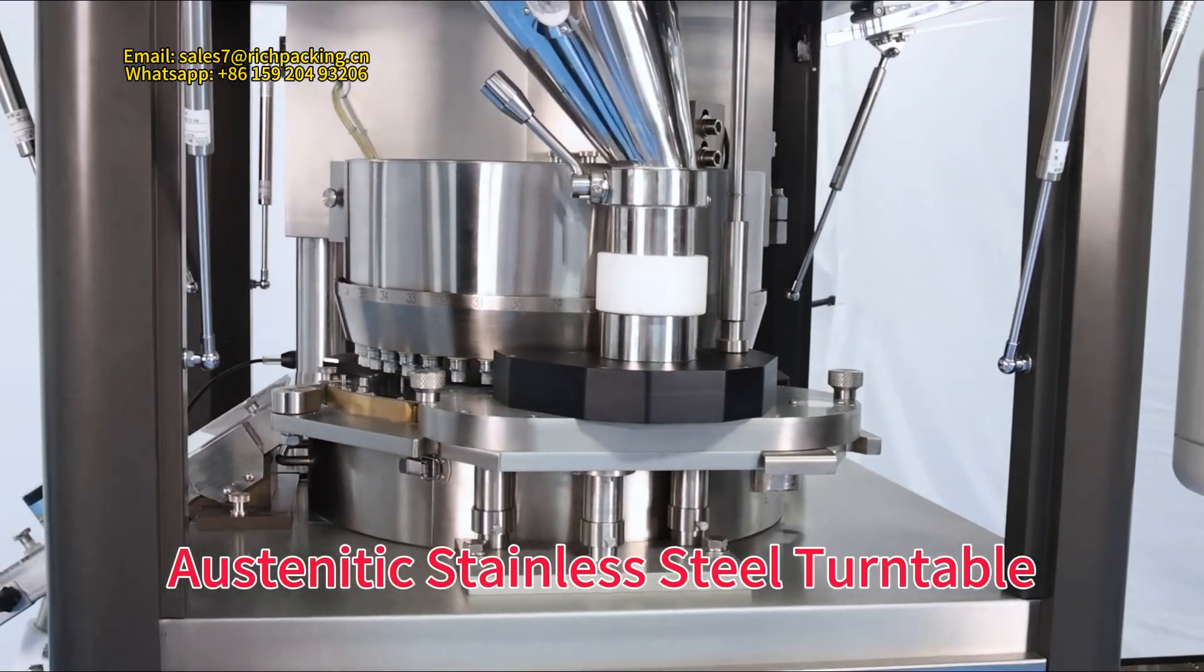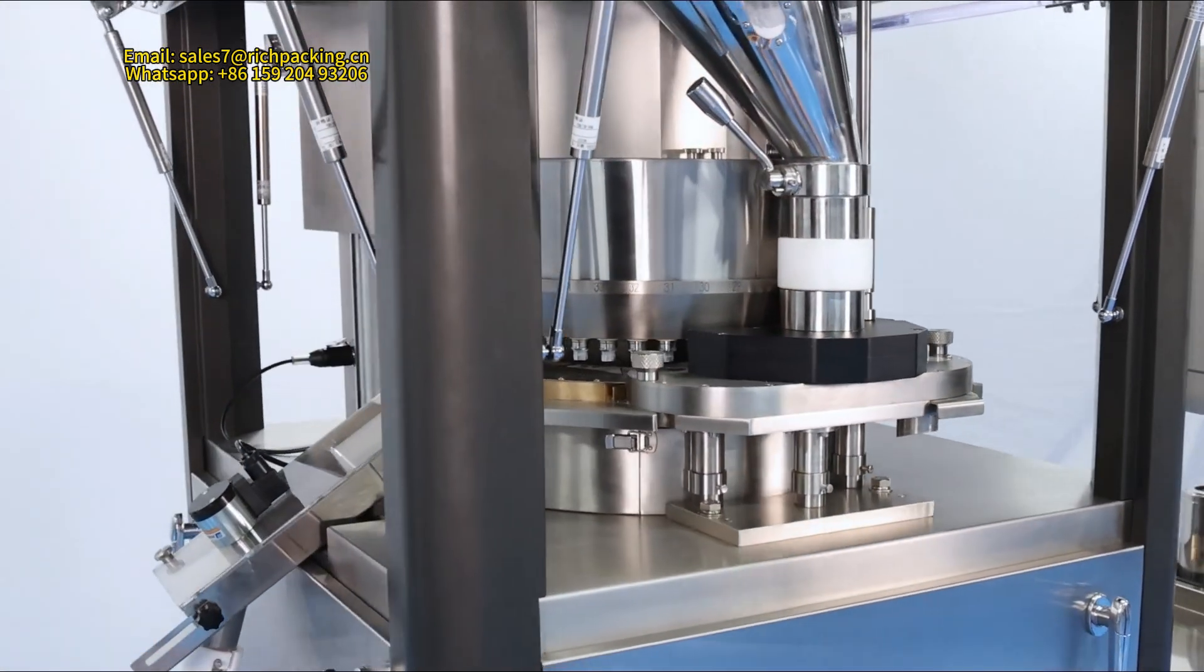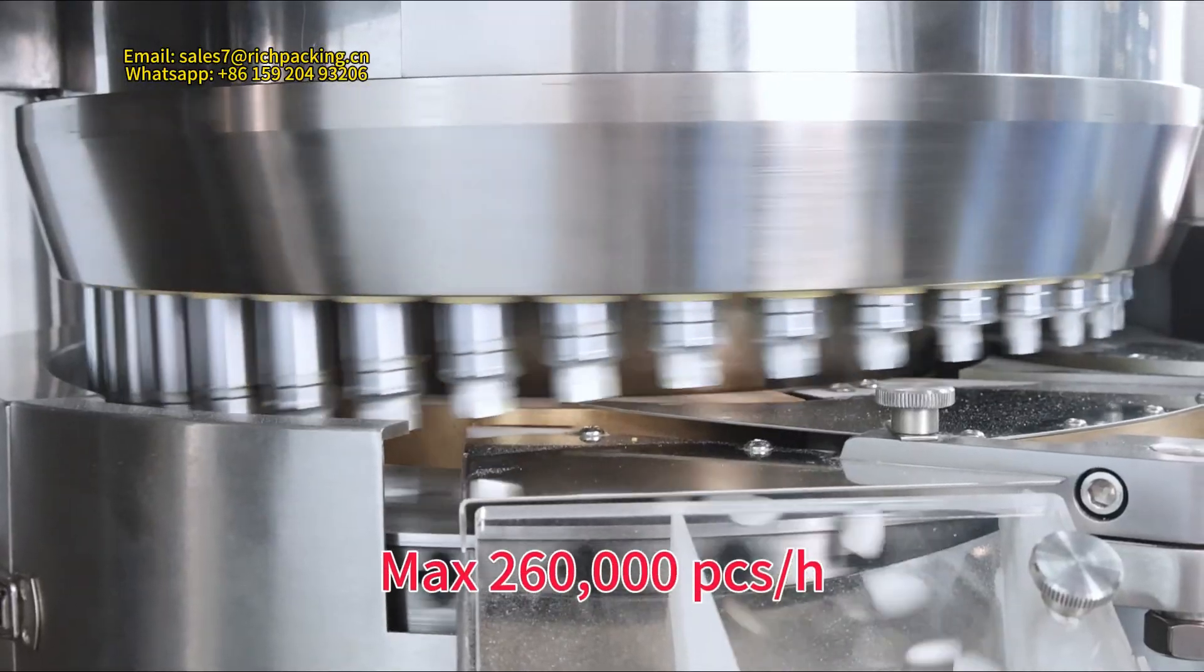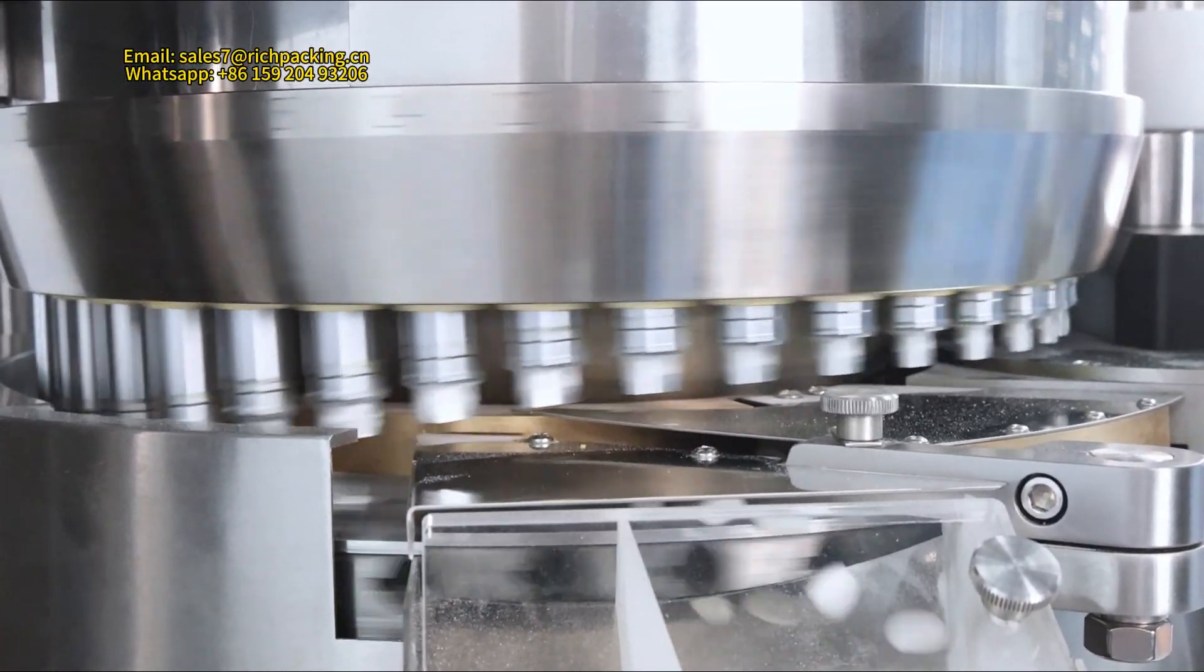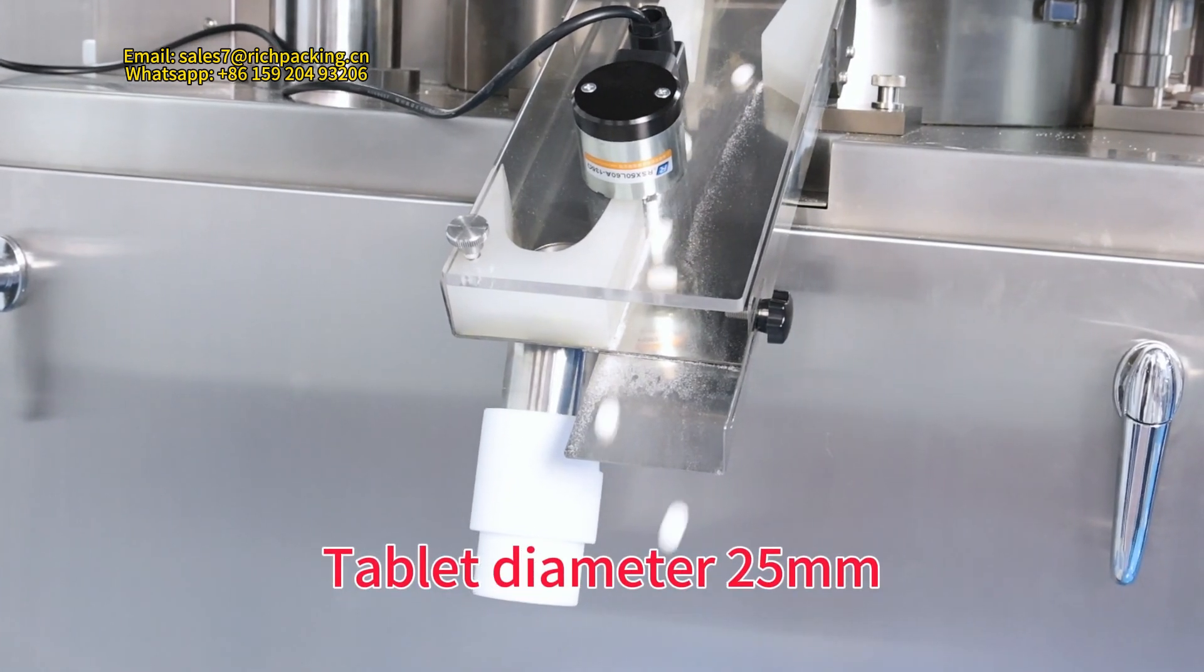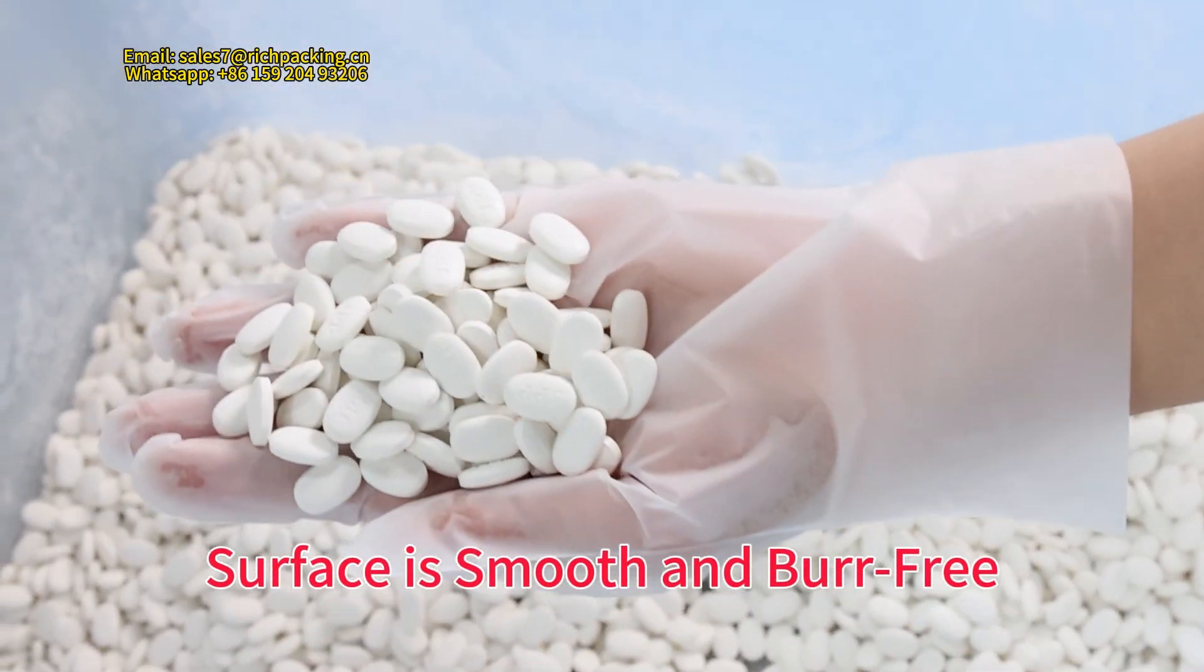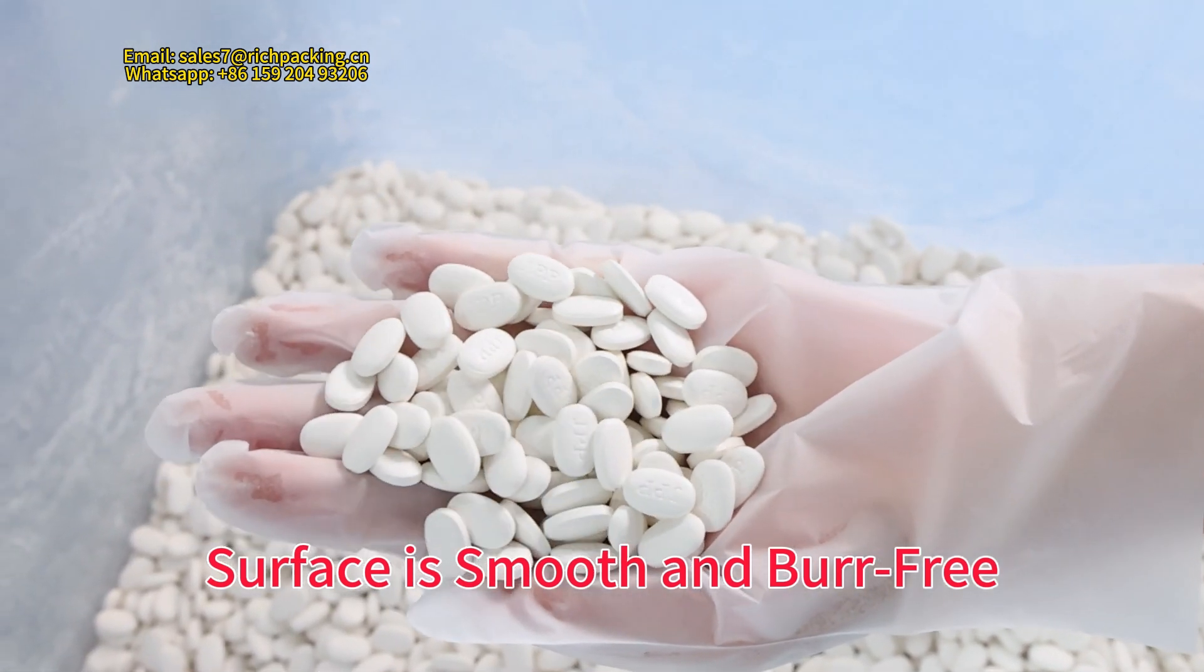Turntable made of austenitic stainless steel. Mass output 260,000 pieces per hour. Tablet diameter 25mm. The tablet surface is smooth and burr-free.